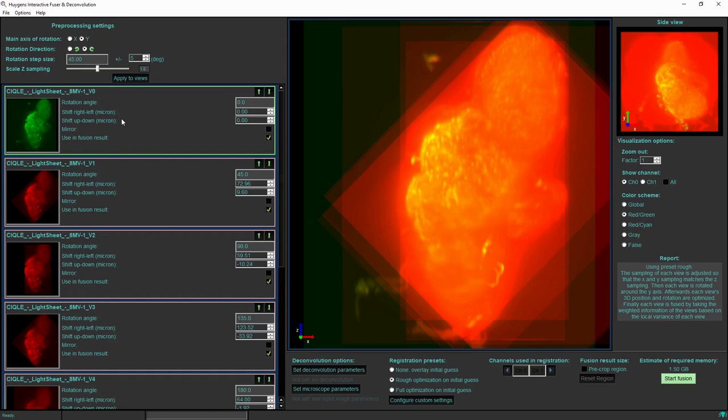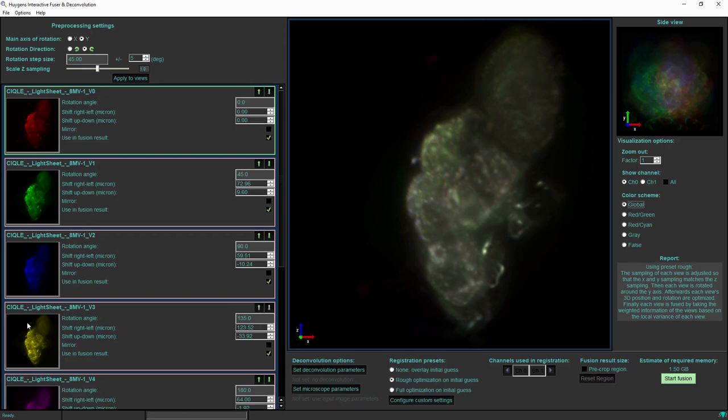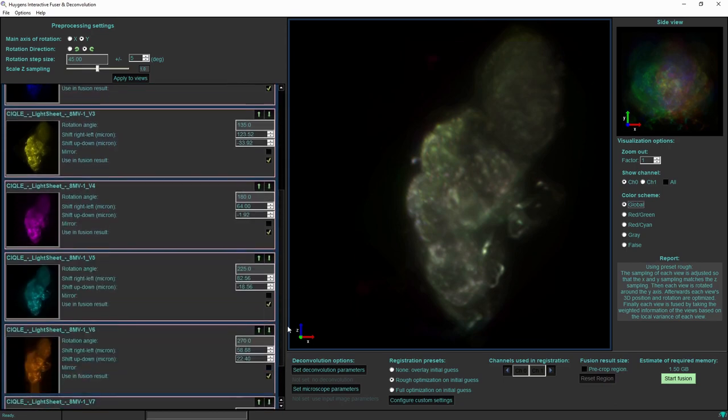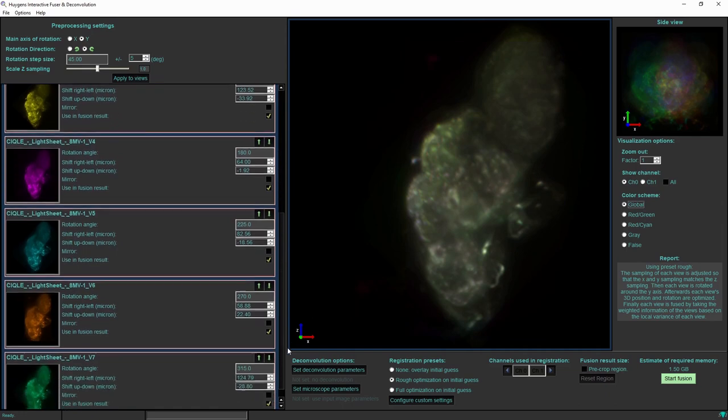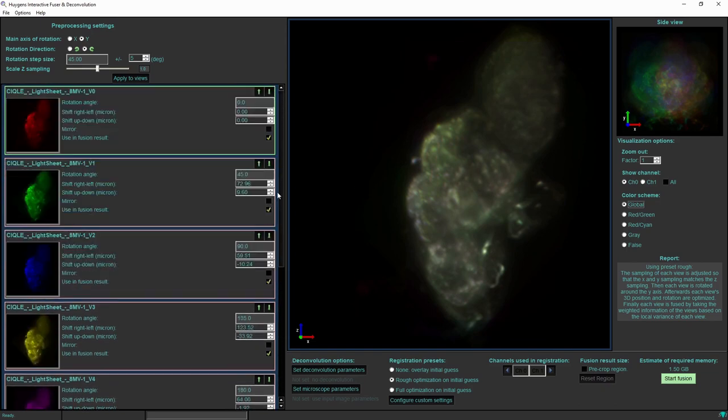For a final check if all the eight views are overlaid correctly I can switch the color scheme from red green into global. Now we are looking at the single channel out of the two channels from each input view, and that channel from each view is displayed in its own color scheme or color scale. So the colors in this case do not represent different wavelengths, but they represent the different views for a single channel.